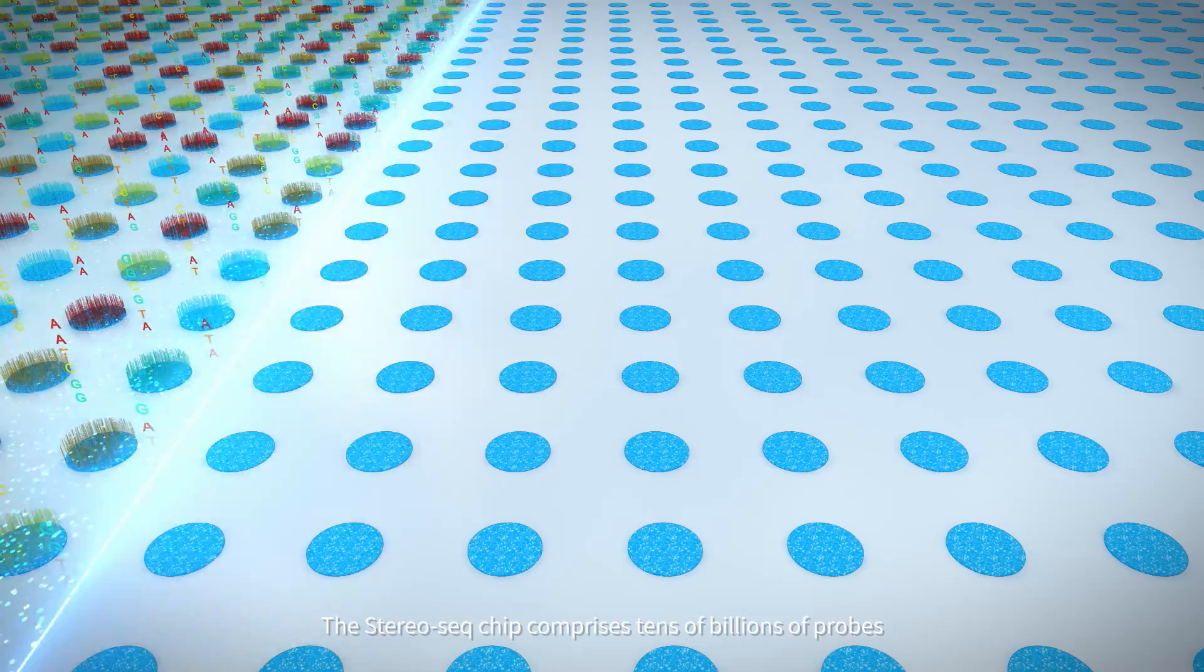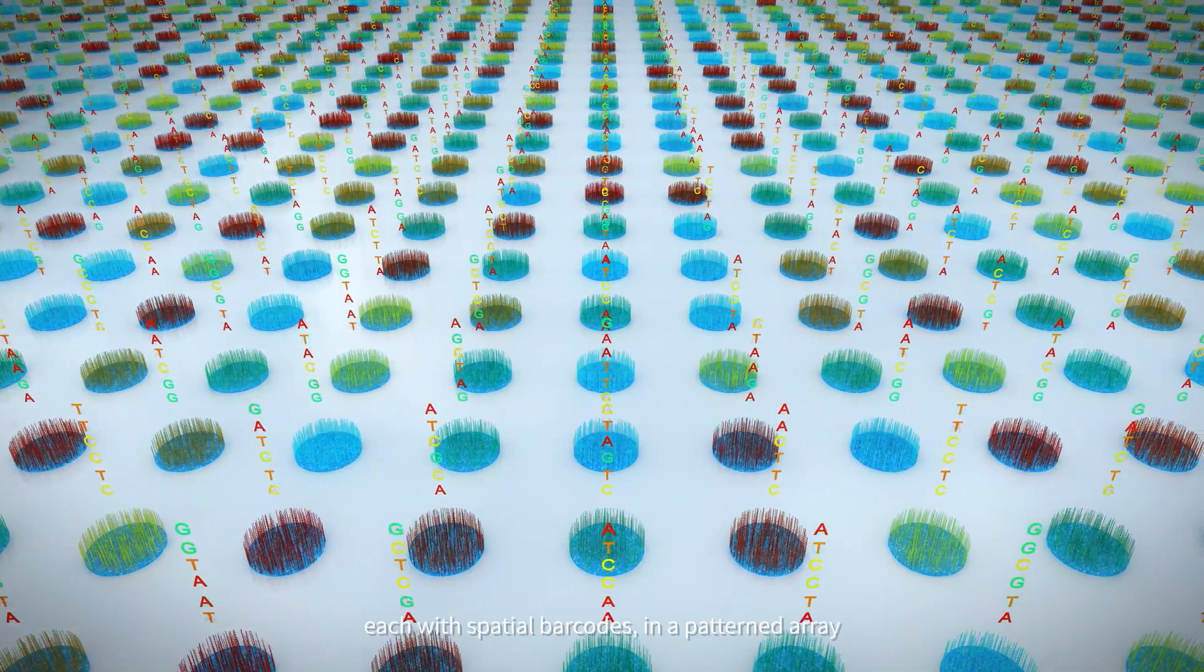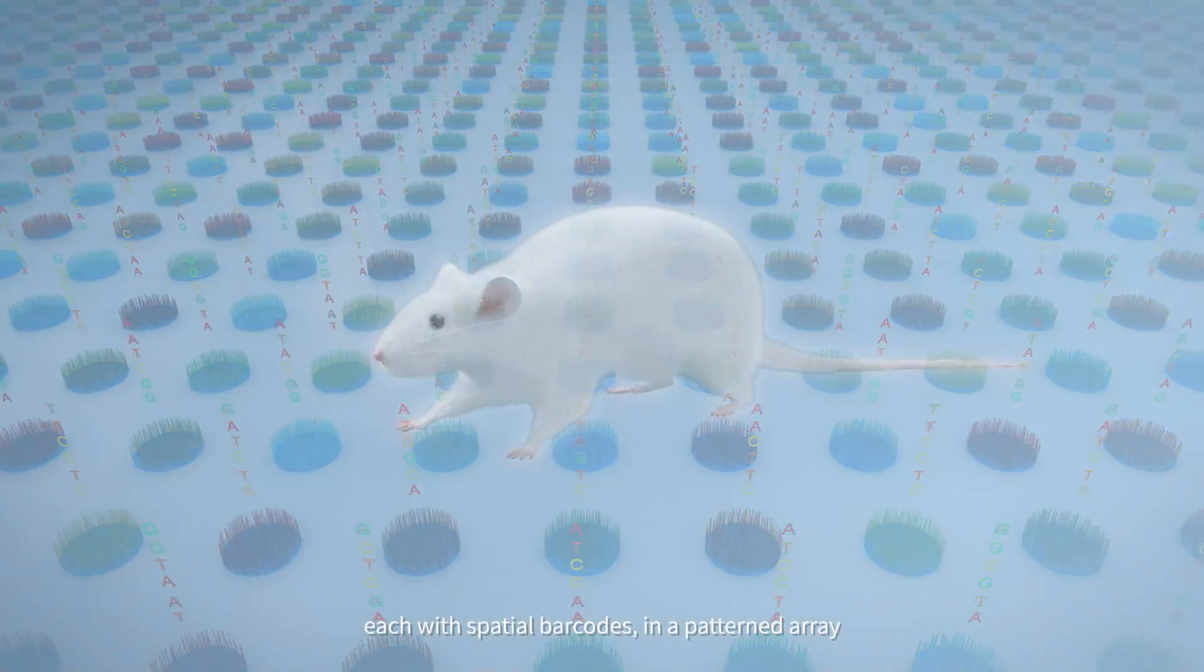The Stereo-seq chip comprises tens of billions of probes, each with spatial barcodes, in a patterned array.